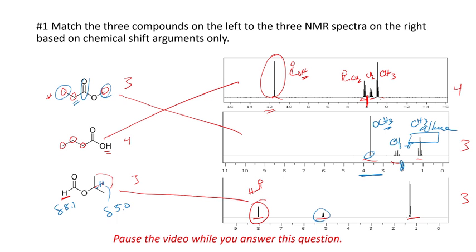You know, it's on an oxygen. It's not really between 3 and 4, is it? It's way down here at 5. But why? Because A, it's a CH instead of a CH3, and B, because it's not just any old oxygen, it's an oxygen with a carbonyl group. So those 2 together conspire and push this from our normal place of OCH3 to OCH with the carbonyl attached. And then we have the 2 CH3 groups. That's this grouping right here.